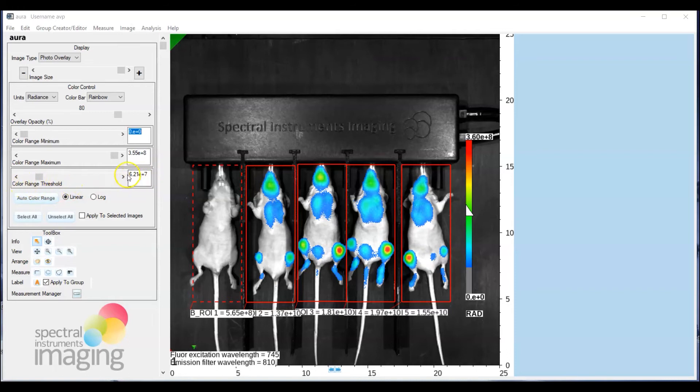So simply take the threshold value and have that be now the color range minimum of your calibration bar. And you can do that by simply typing it in.